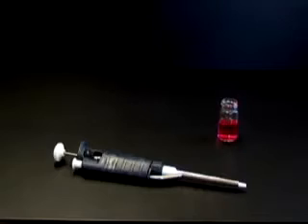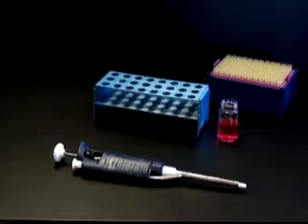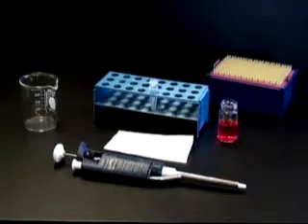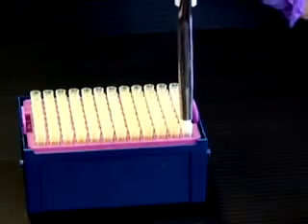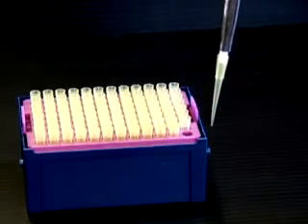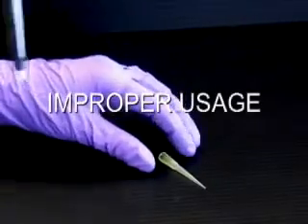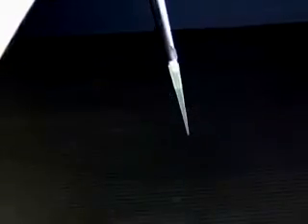Now it's time to transfer your sample. You will need your appropriately sized Pipetman set to the desired volume, the correctly sized tips, a rack, the new container, a Kimwipe, and a waste container. Attach a disposable tip to the Pipetman by pressing its plastic shaft firmly into the tip with a twisting motion. This action should ensure an airtight seal and prevent leaks from occurring. Always use a new sterile tip for each sample and never let the tip touch anything except sample.